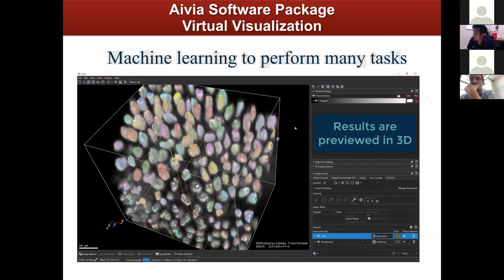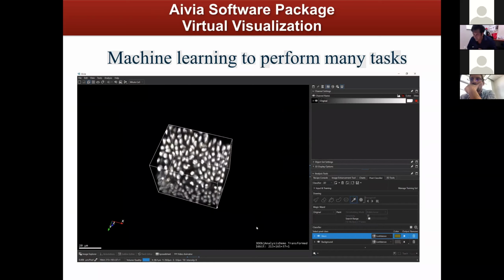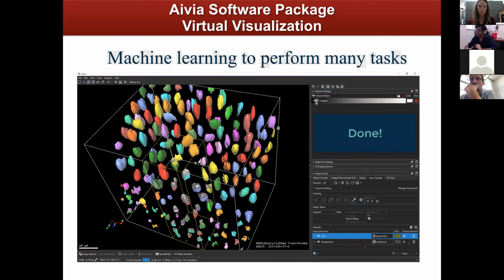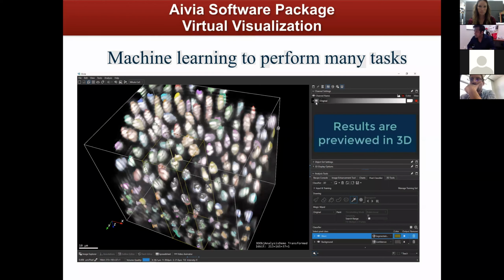You may have done like 10% of that whole density map, and then the machine learns the process and will do it. You can also define the parameters here. You can define the grayscaleness. Or if you say that you do not want to do the segmentation, you just give the parameters, based on which the program will do things like flooding the image or background calibration.